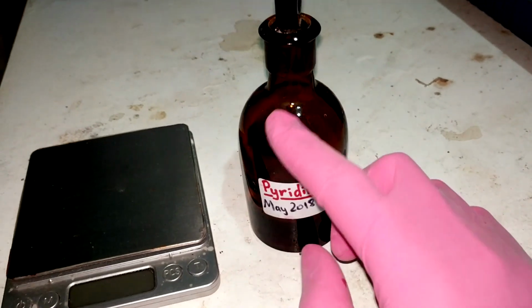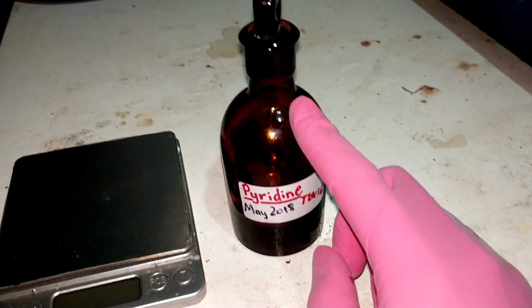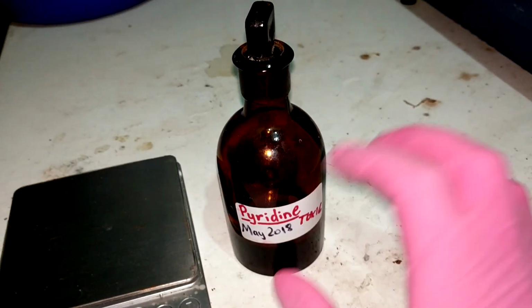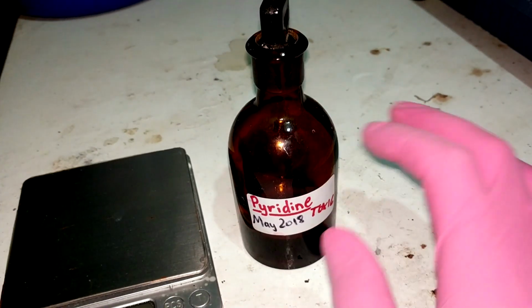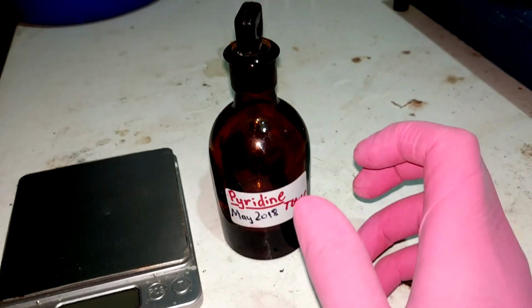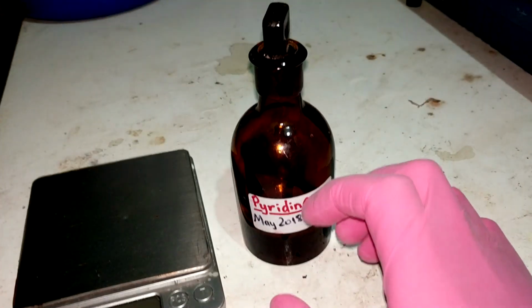But of course, as I've mentioned a few times, that lowering of the yield really is because of that niacin that we put over, because we just overheated it a bit too much. There was that thought about maybe copper oxide would perhaps destroy some of the pyridine. It's hard to say if that actually had an effect or not. I was really thinking it wouldn't, but the fact that we're getting less than 70% yield, looking at the amount of niacin that crashed out of the pyridine during the second distillation, it's hard to pin a 20% loss of yield on just that amount of niacin.